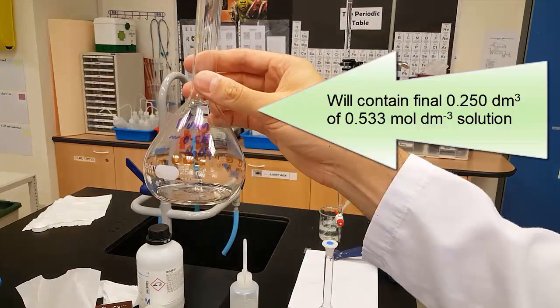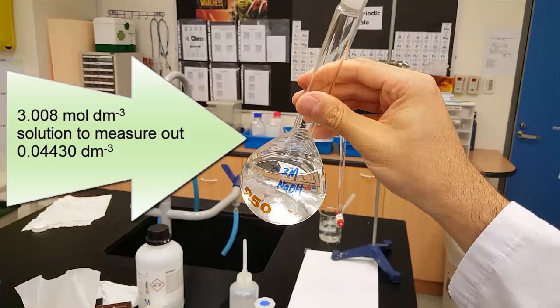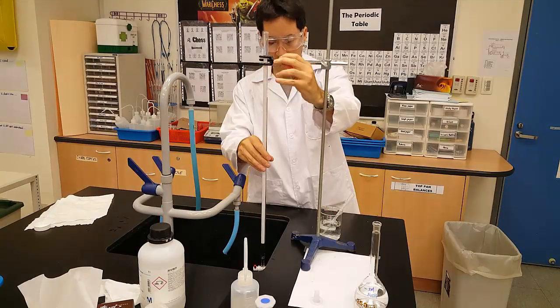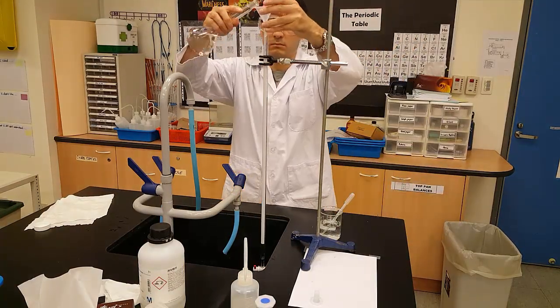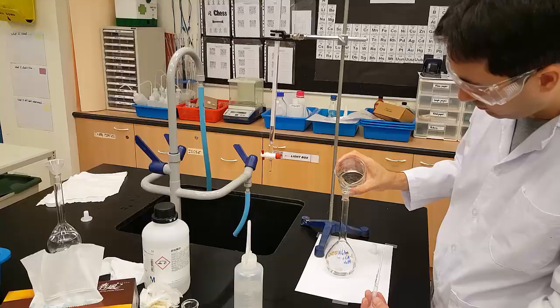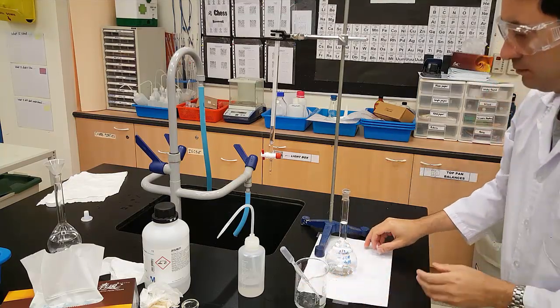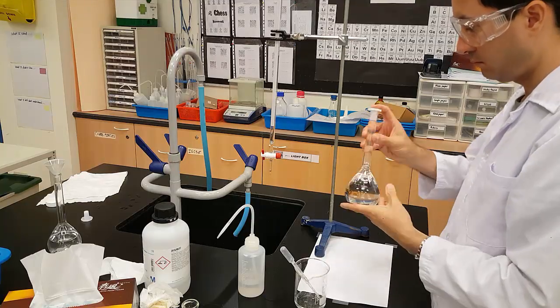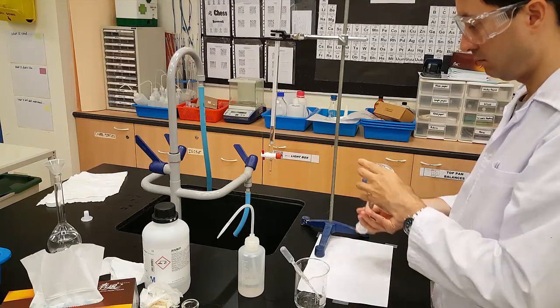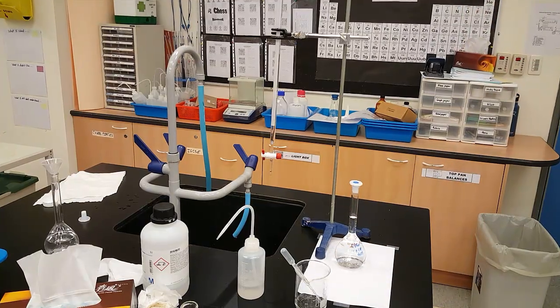So I have my volumetric flask here that I'm going to fill, and here is the volumetric flask that contains the 3 molar standard solution, and so I fill in the burette so I can get 44.3 mils accurately in one shot, and so I measure it down to 44.3. I then fill up my volumetric flask and I make sure it's mixed, and now I have, from a 3.008 molar solution, I've created 250 mils of 0.533 molar solution.